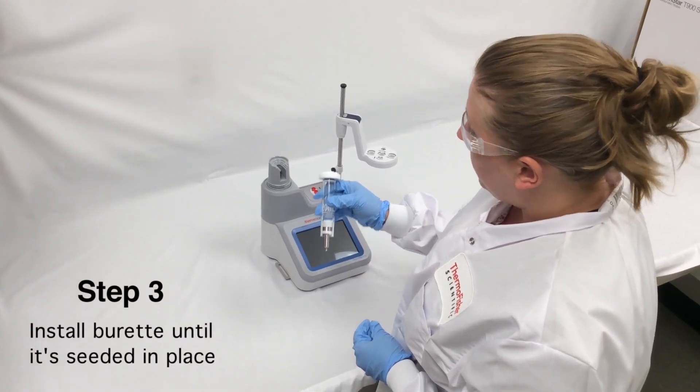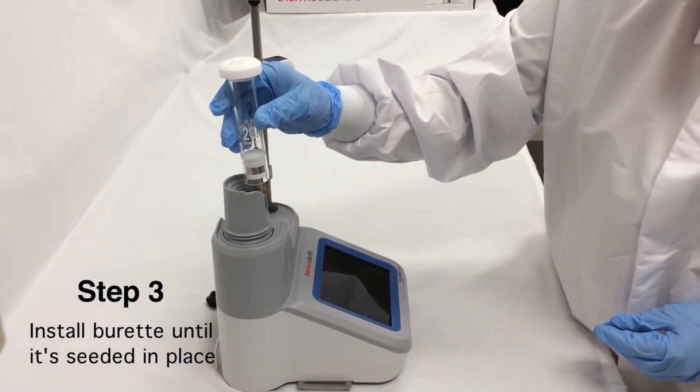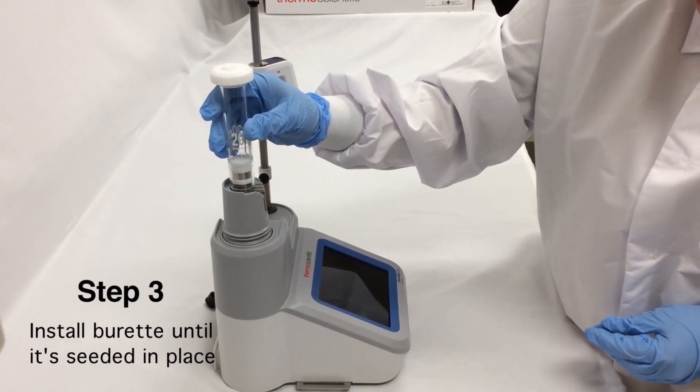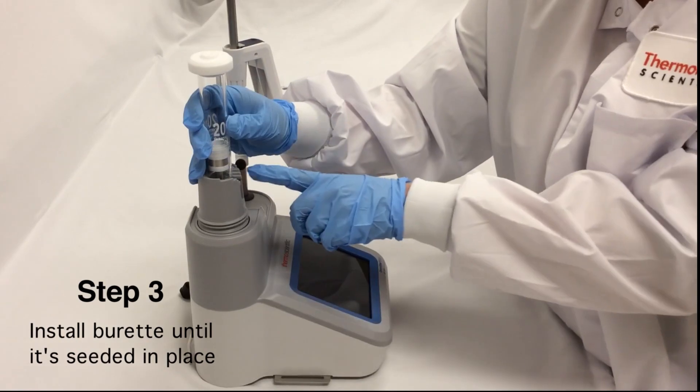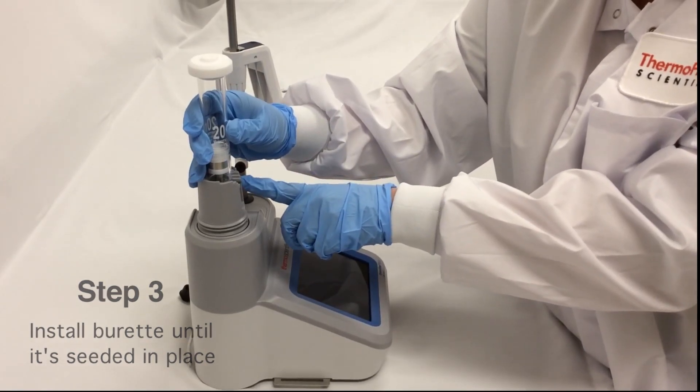Install the burette by lining up the piston ball on the burette with the clasp on the titrator. Gently slide it in and push down on the top until the burette is seated in place.